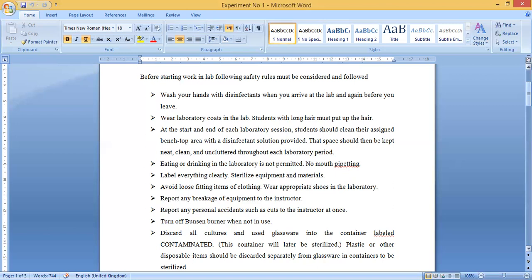Eating or drinking in the laboratory is not permitted at any cost. You should not carry any eatables or such belongings into the lab — these are strictly prohibited. Moreover, mouth pipettes should never ever be used in the lab. Always use bubble suckers or press suckers for pipetting.